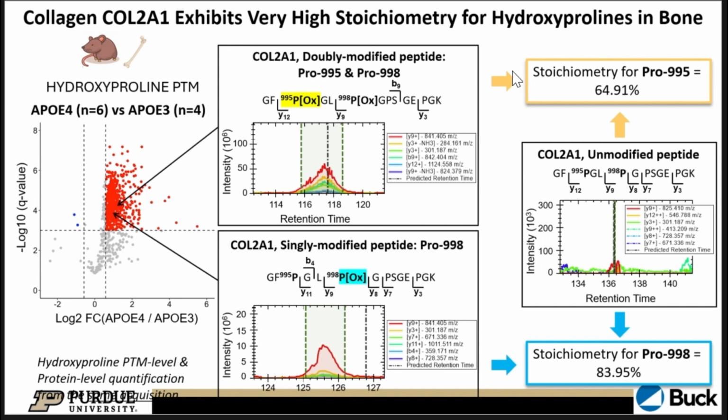A lot of phosphopeptides, for example, phosphotyrosines, are sometimes only 0.1%, and they still impact the biology greatly. So you can imagine how such a massive PTM regulation really can influence your bone stability in this case. And yeah, we get all these stoichiometry readings for free now.